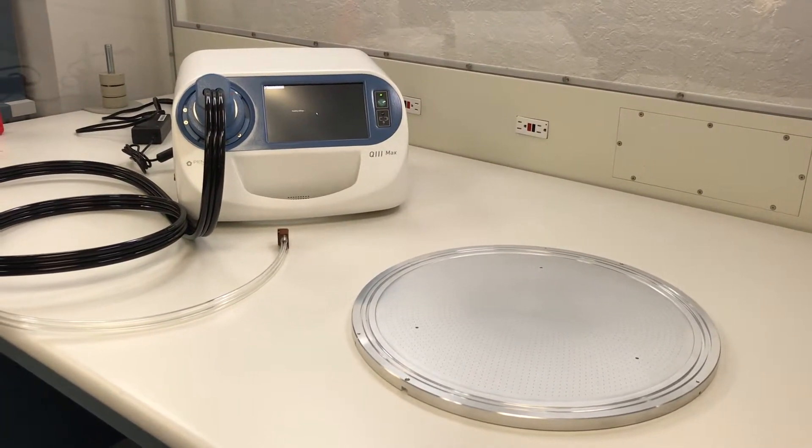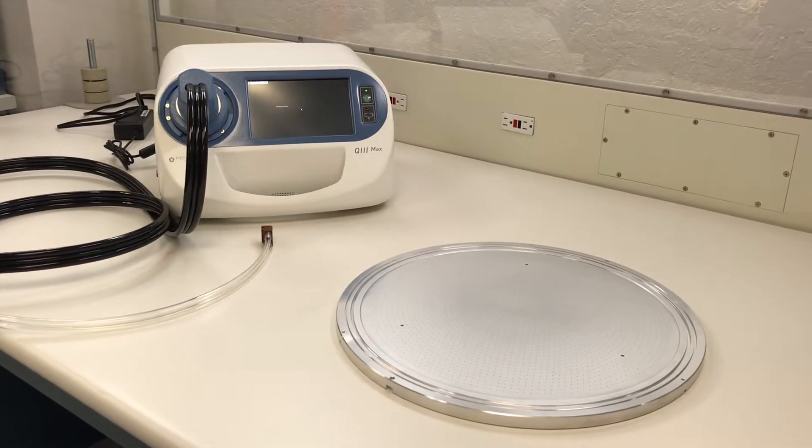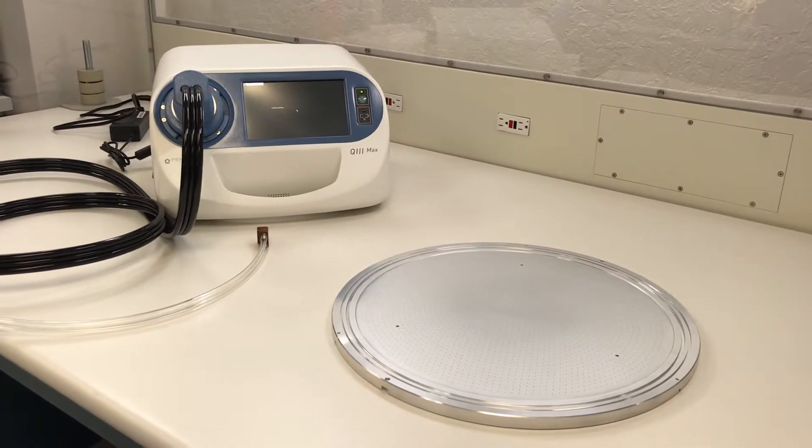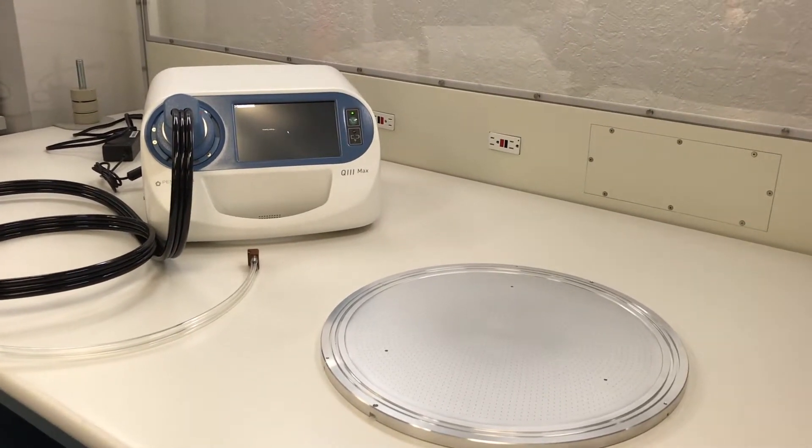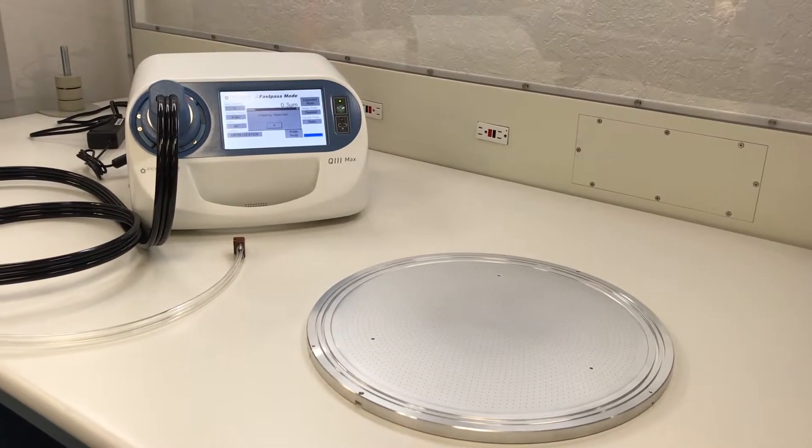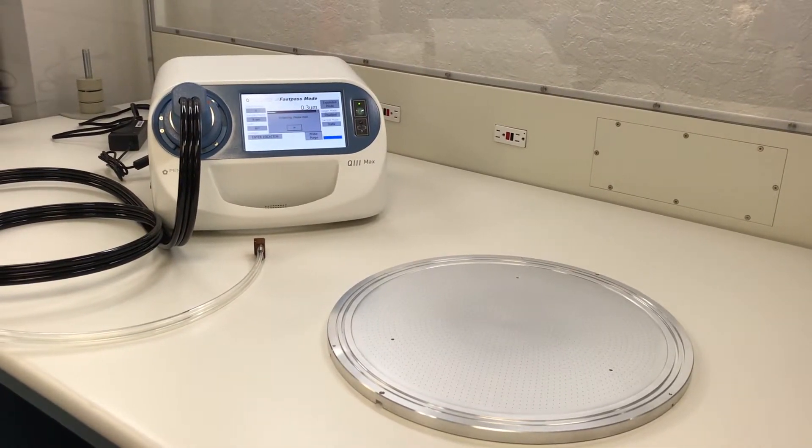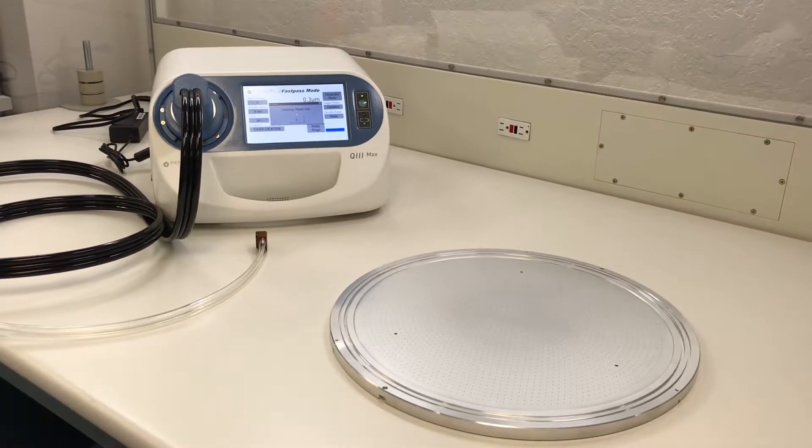The Q3 is the standard for particle detection on critical surfaces. The Q3 Max detects particles down to 0.3 microns or 300 nanometers. This demo is an overview, however to get detailed information please refer to the manual. In this demo we will show how to purge the system and make a few basic measurements.